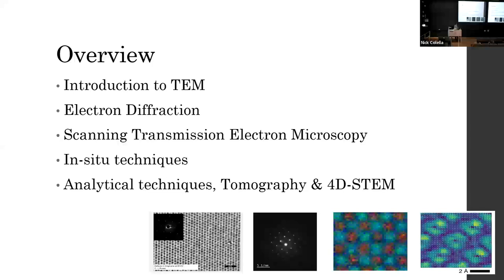Okay, so I'll start with an introduction and just give an idea of what the TEM is, just to cover the basics there. And then I'm going to dive into a couple of different topics. So we'll talk about electron diffraction. Then we'll talk about a technique that I do a lot, which is called scanning transmission electron microscopy. And then we'll go into some slightly more niche topics. So we'll start talking about some in situ work and then some analytical techniques at the end if we have time.